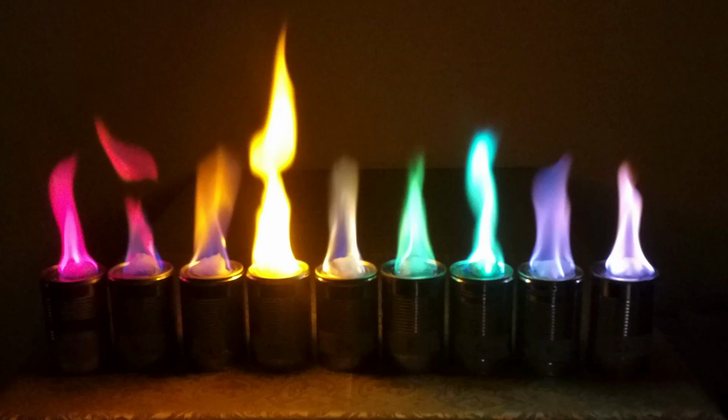A flame test is a procedure used in chemistry to detect the presence of certain elements, primarily metal ions, based on each element's characteristic emission spectrum. The color of flames in general also depends on temperature. See flame color. The test involves introducing a sample of the element or compound to a hot, non-luminous flame and observing the color that results.